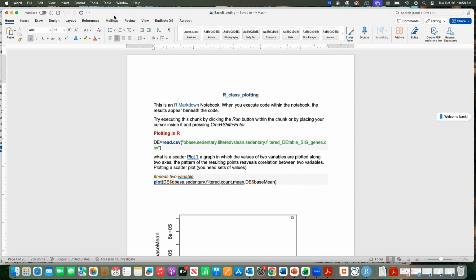If you are not in that particular working directory or folder, then you give the whole path, and it will take the data from there and execute it. But in the case of R, that is not how it works. Before that, I am not here to teach you R. I am going to teach you how to use R for your application. So, I am not going to give you any theoretical aspects of R programming. I am going to give you a more practical way to approach it.